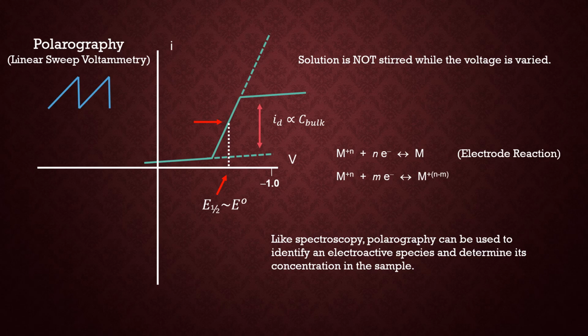So polarography, voltammetry, is essentially like an electrochemical spectroscopy. I can identify the material from the energy relationship, namely the voltage, and how much from the response. So current here is analogous to absorption, whereas the E1/2 is analogous to the wavelength in spectroscopy.